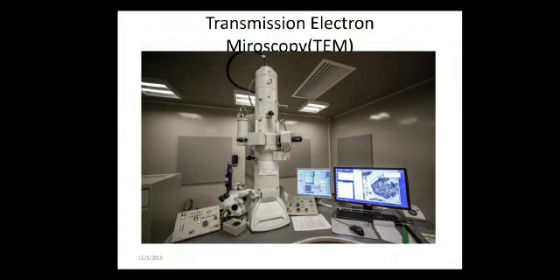In short form, we'll say it's a TEM. So TEM uses high energy electrons, with accelerating voltage up to 300 kilovolts, which accelerates the electrons to nearly the speed of light. The electron beam behaves like a wavefront with a wavelength about a million times shorter than light waves.